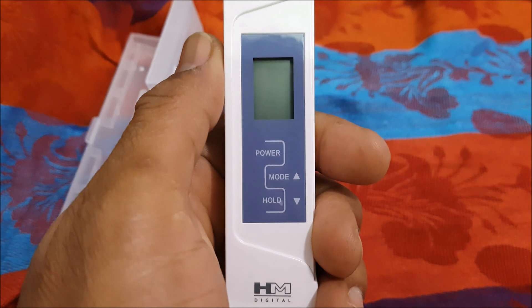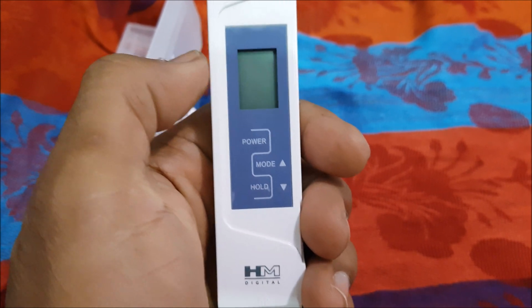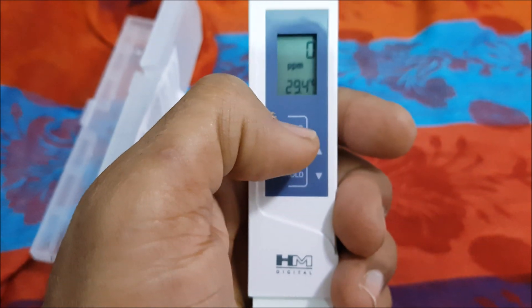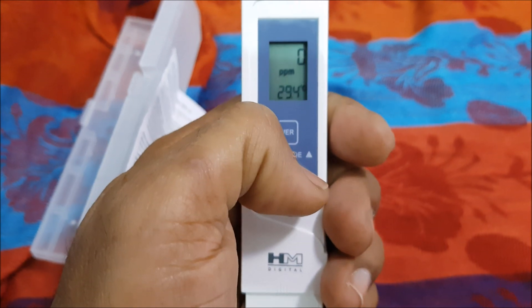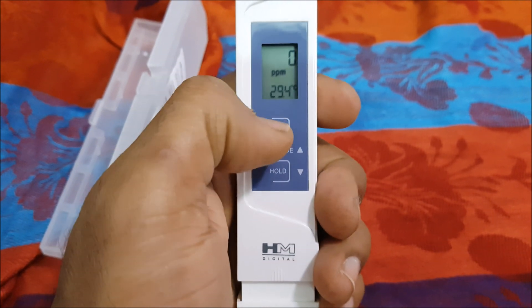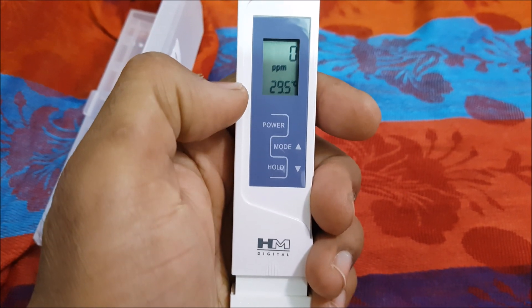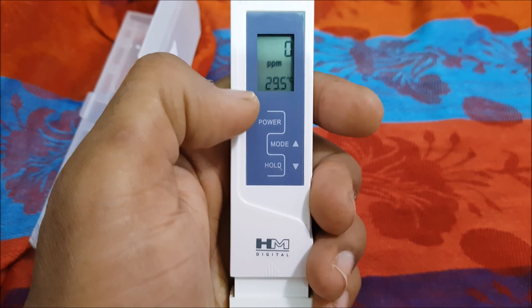To calibrate, you purchase distilled water and dip the meter in it — if you feel the readings are not correct. Distilled water has zero TDS. Press power, then press mode, dip the meter in the distilled water, and use the plus and up/down buttons to align the reading to zero. Then press the mode button again to save. However, be careful — you could accidentally press the mode button, which would be risky.